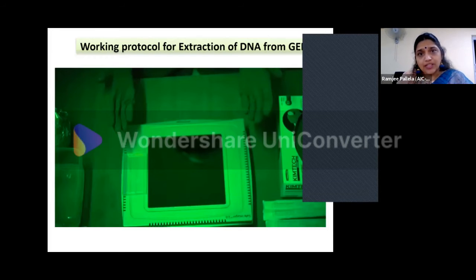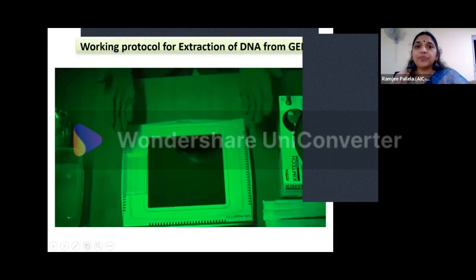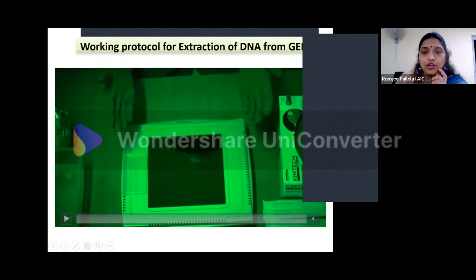So if you have put it in the gel, then you need to recover that particular DNA, right? Because you will be losing it. How will you do a sequencing thereafter? So for that, we need to do a gel cutting, or the gel extraction, DNA extraction from the gel. So we do it on a transilluminator.